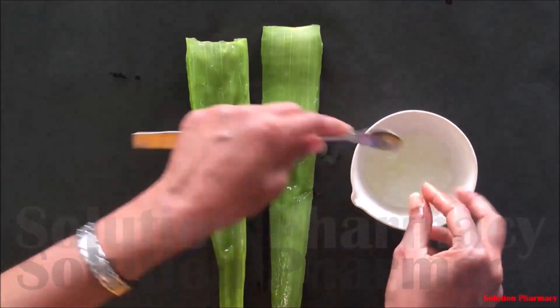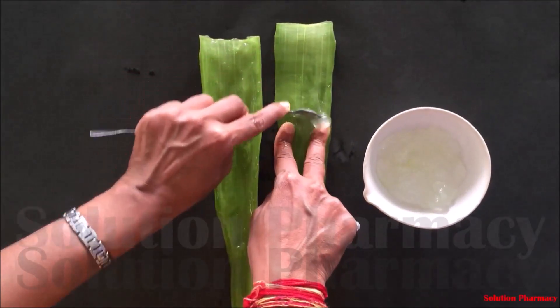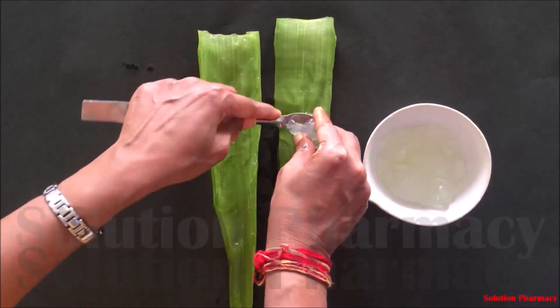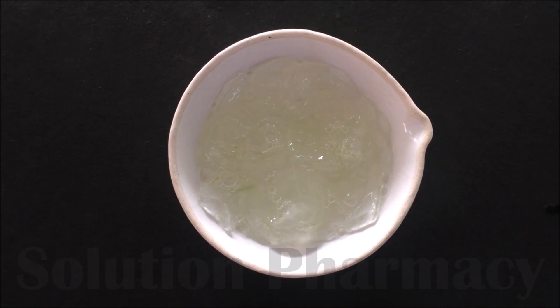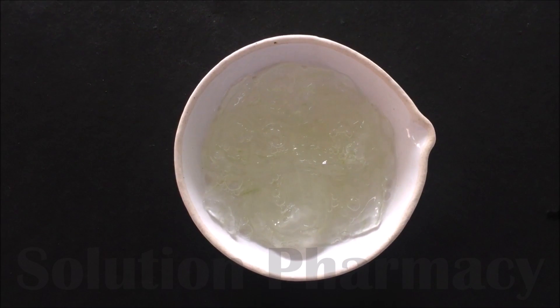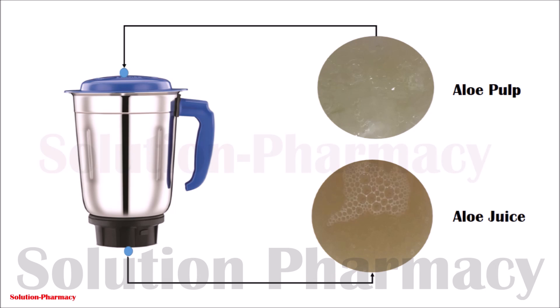Now, by using a spoon or spatula, scoop out the pulp — collect all the pulp and transfer it into the container. Completely scrape out the pulp of both halves of the leaves and do this very carefully so that it does not include any green part of the aloe leaf. Here we have collected all the aloe pulp into the china dish.